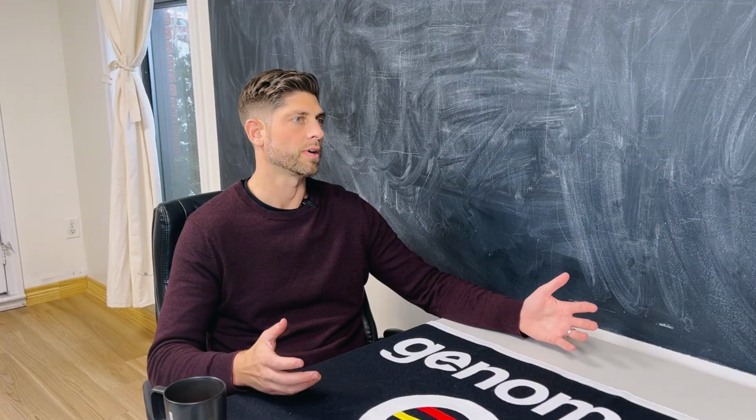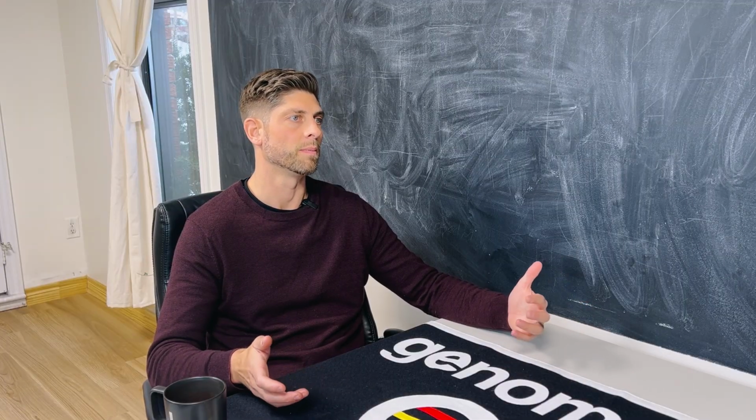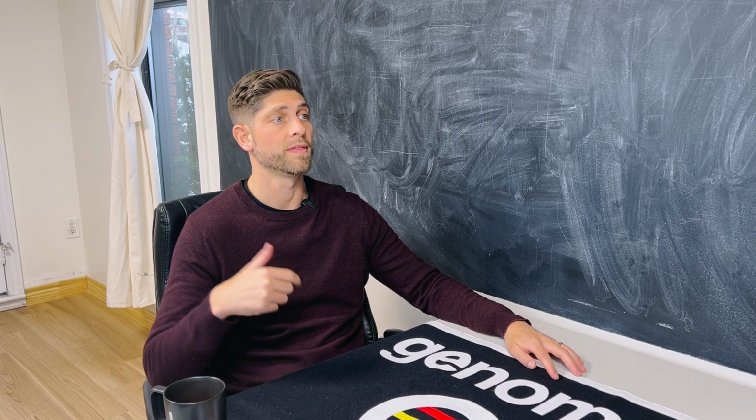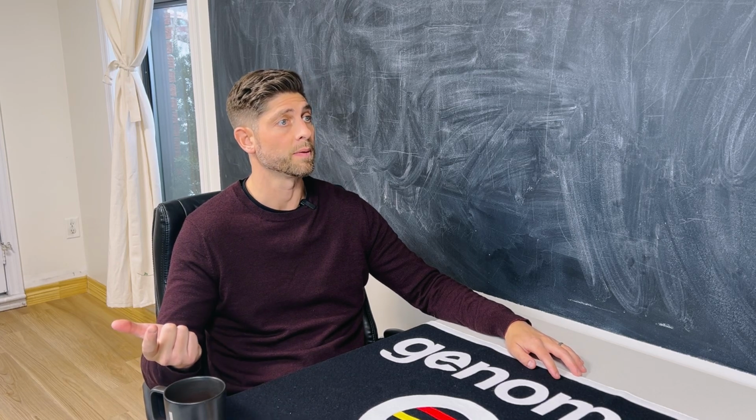Up here in Canada, for instance, people will have had biomass sitting in storage for a year, right? You'll have had some conversion, and it doesn't really make a nice, high terpene extract. It forms a brown goop of sorts, but it has high THC, and so it's good to send it to the wiper. And we can recover the vast majority of the value from a low quality biomass, first crystallizing it, and then recovering remaining THC from the terp sauce. And the rest of the terp sauce is basically just a throwaway.